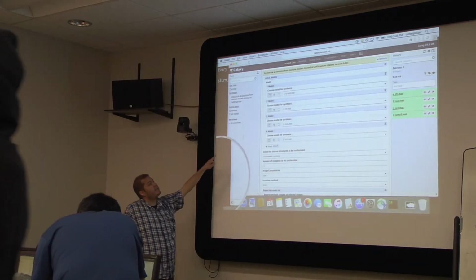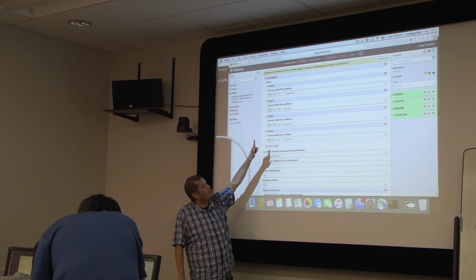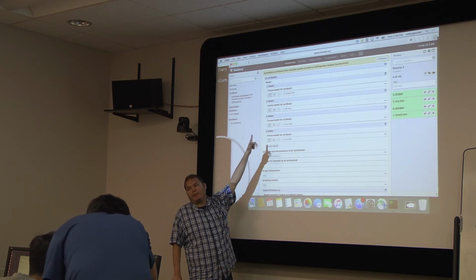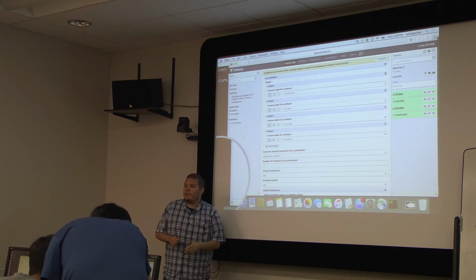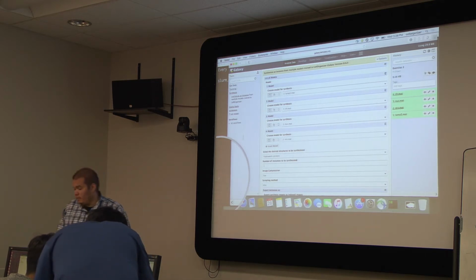So I'm going to get an image that has channel number 1, nuclei, channel number 2, the cell membrane, channel number 3, the protein from the first pattern, channel number 4 from the second, and so on. And you could potentially add as many proteins as you want.